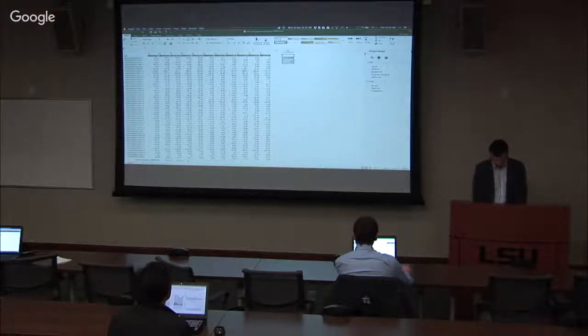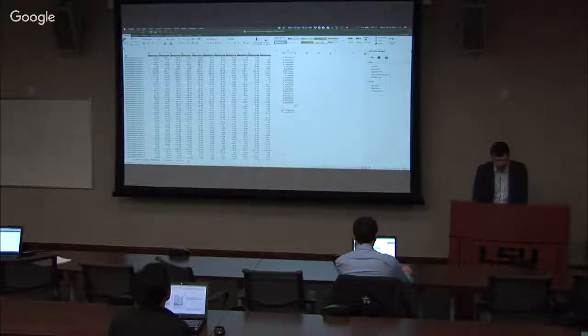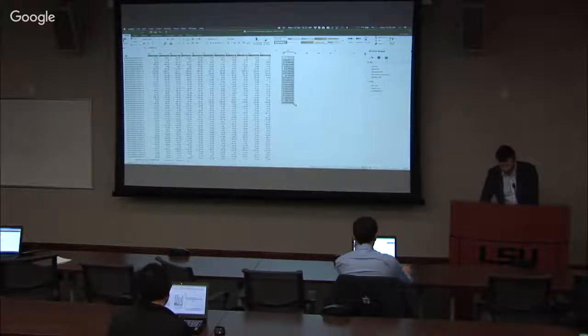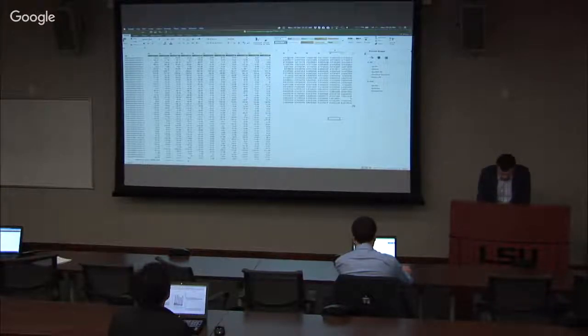Right, so this is exactly what we're doing: we want to take all of these samples and just do log scale of all of the data points. So I want to take this gene and this value of its expression and I want to convert it to log scale. So what I would do is I will take the natural logarithm of this plus one, and I just do that because now I can copy and paste it and not worry about the zeros, right? And so I can stretch it out, and I will get it for all of the samples, right? Each column, and then when you're comparing two columns with the correlation plot, now they look more correlated. Exactly. Yeah. Okay.